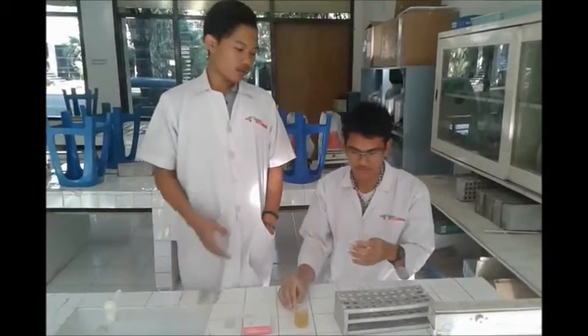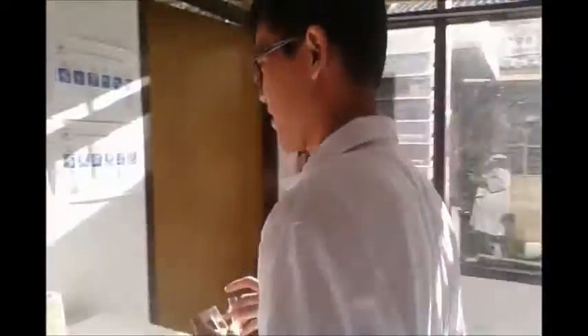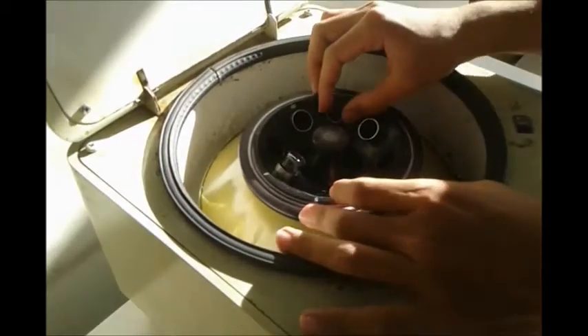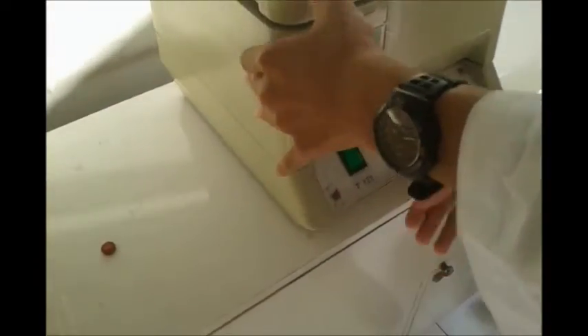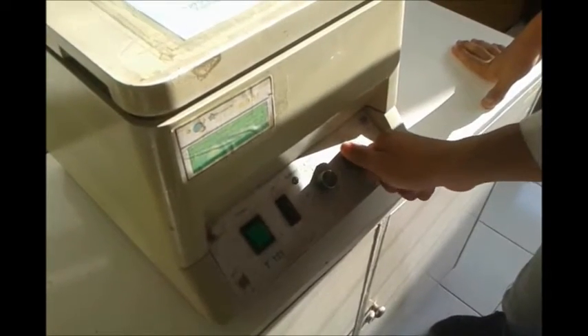Next, take two centrifuge tubes. They will be placed in a balanced position. I will put them in a balanced position. If you put them here, it's not a balanced position, because the centrifuge will vibrate. So I will put them in a balanced position. And next, we close the centrifuge and spin the timer until five minutes, and the speed until 2000 RPM, and turn it on.